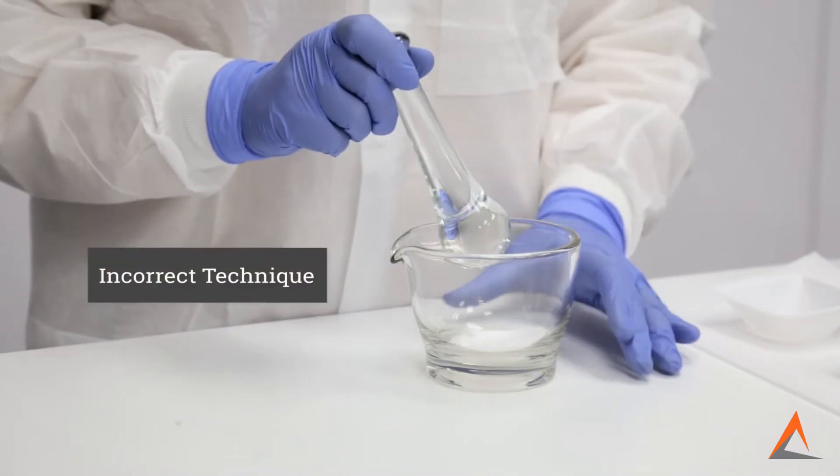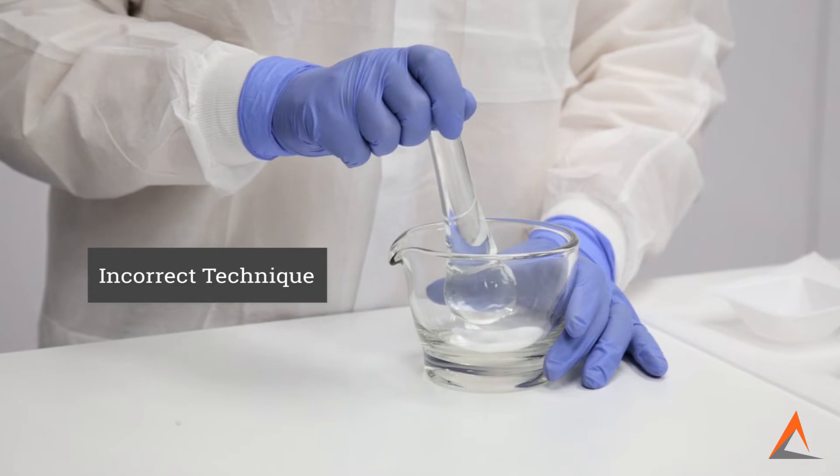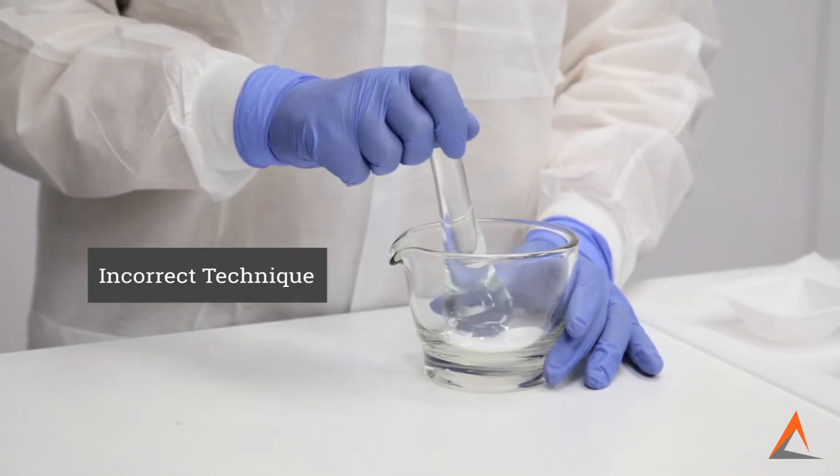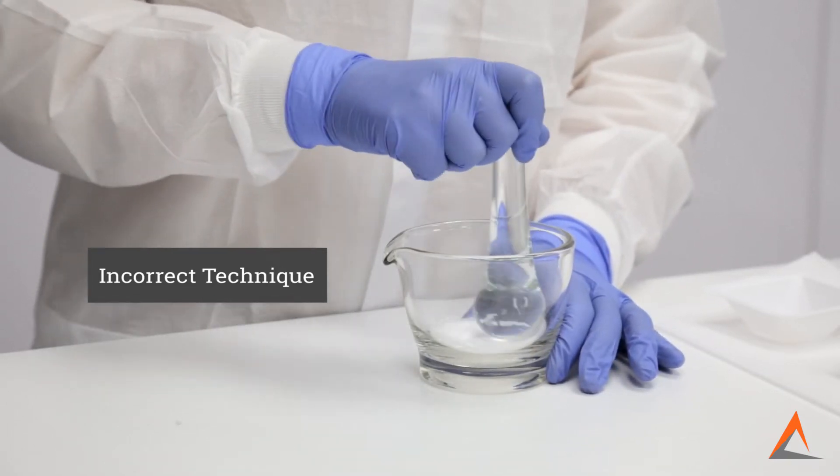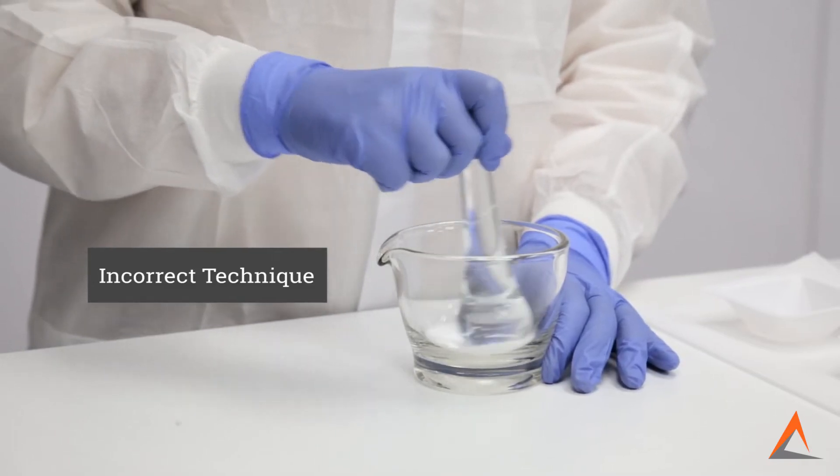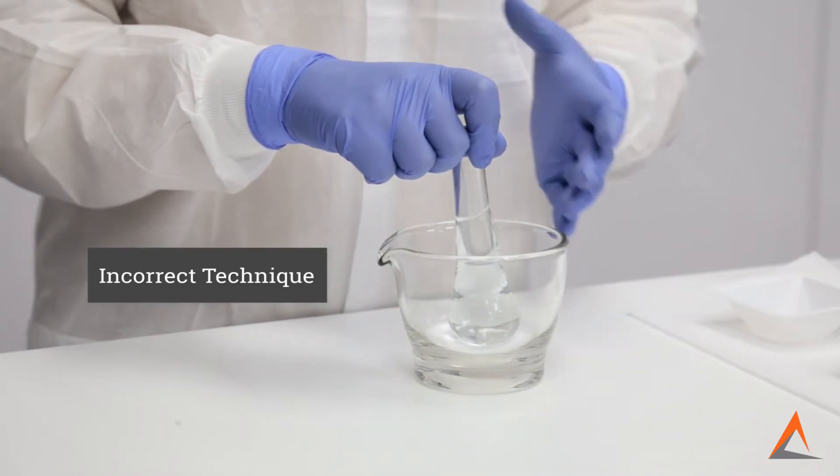What you don't want to do is lightly hold the pestle only by the top and softly move it around the mortar. This will not allow you to have enough grip on the pestle and, in turn, you will not be able to apply adequate force to grind down the particle size.